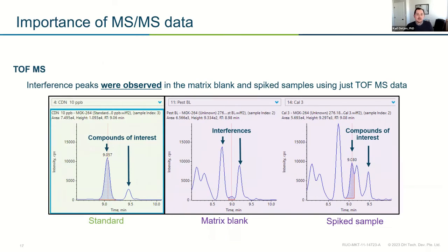So yeah, you could definitely quantify, build a calibration from that parent mass, and then figure out what the concentration is in your unknowns. But what happens when that isn't enough? So one thing I get asked about is why would you use MS/MS data for quantitation?